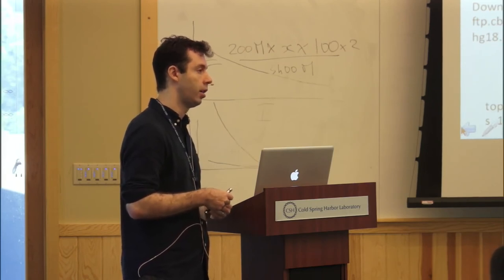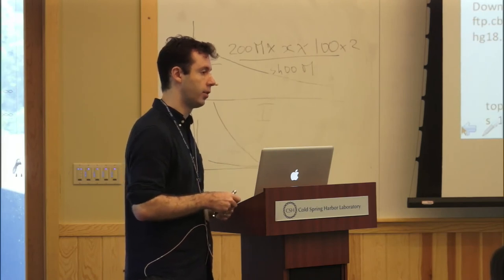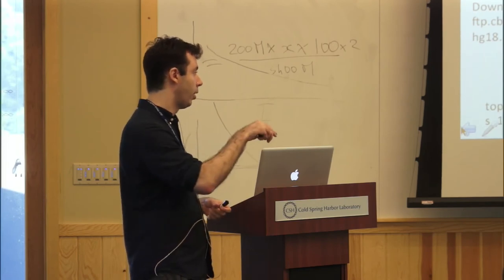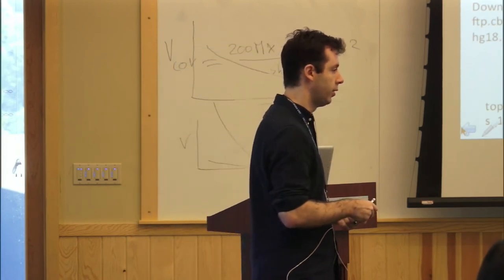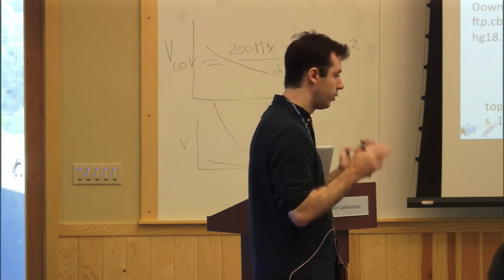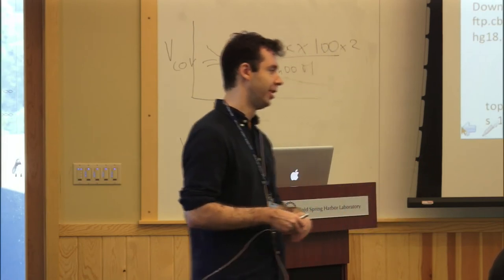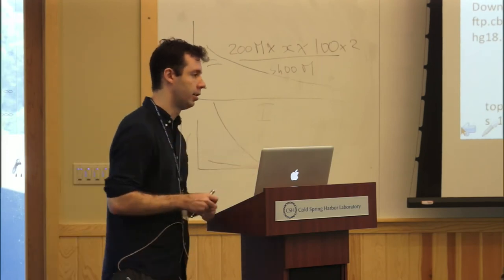If you have a very long potential insert size, but you don't need that number if you only have single-end data, right? No, that's right. This number is only for paired-end. But again, it goes back to the question of paired-end versus single read in RNA-seq. If you really want to look for isoforms, paired-end is a requirement. Even so, it's not going to give you perfect isoform information, but at least it's going to help.